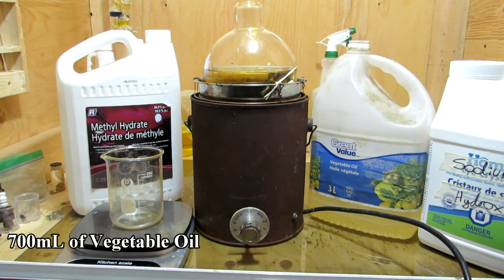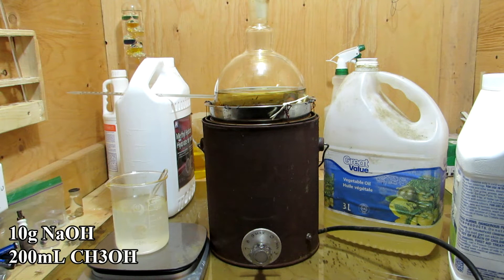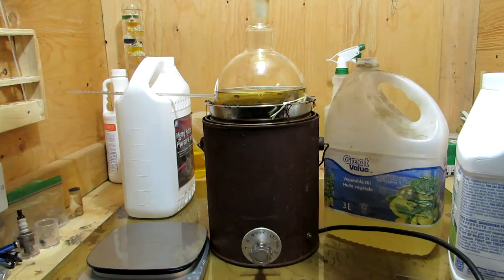To begin, we can add around 700 milliliters of vegetable oil to a round bottom flask and load it in our homemade heating mantle that we made in a previous video. We can then begin to heat the vegetable oil to around 50 degrees Celsius, and in the meantime prepare a solution of 10 grams of sodium hydroxide and 200 milliliters of methanol. This can then be added to the flask.